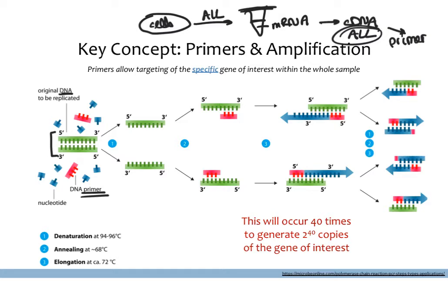And to go back to some basic biology, the reason the primer is necessary is because our DNA polymerase can only build if there is a primer segment. It cannot build on DNA without a primer. And so if we add in that primer, we limit DNA amplification specifically to the part that we are interested in. So our primer here is going to be specific to this segment of DNA. We'll call this gene 1 that we are interested in. And it's basically going to go through a replication cycle driven by the temperatures. So first you're going to denature it and separate it out. The primers are going to go in and bind. And then they're going to extend a new DNA segment. And then they will have created 2 new DNA segments. So from this one segment, we will have 2.